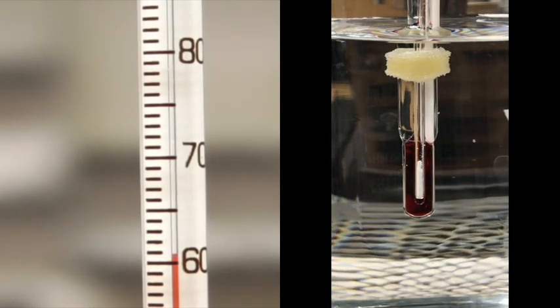Okay, we moved above 60, so we should be about 65. We should start watching really good.